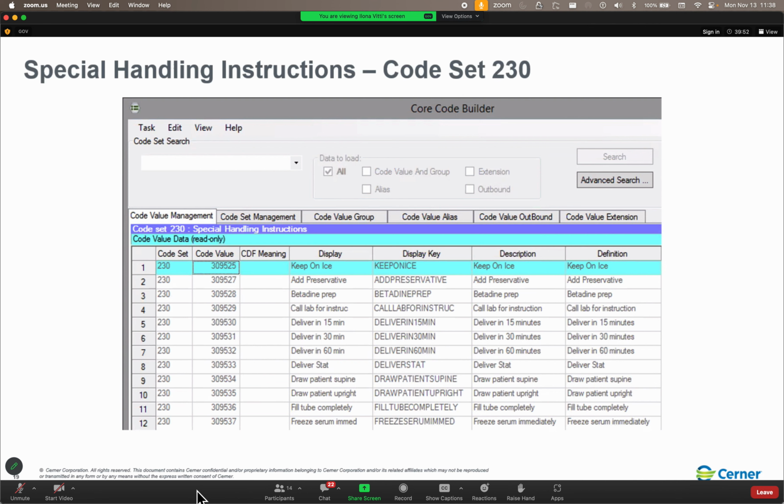So if you build a collection priority in Bedrock, it basically will function like a routine. And I am willing to bet my next dessert, you already have a routine. So this is one of those cases where just because you can add it in Bedrock, I don't recommend it, because of all of the different parameters that aren't set when you build it in Bedrock. So any questions here?